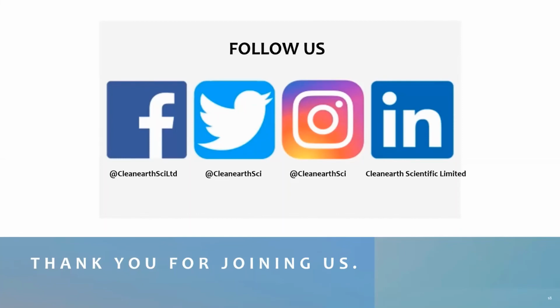Okay. Thank you, Josphat. I believe the person who asked that question, you have your answer. There is another question from Samuel from MERCK Chemist. Your question is, what are some of the consumables you recommend when you purchase the Milli-Q equipment? I'll take part of that question. You just need your filters and then some type of column. Josphat, I'll leave it to you.